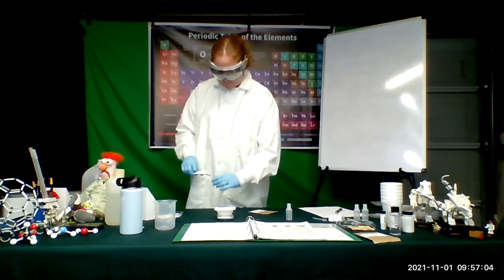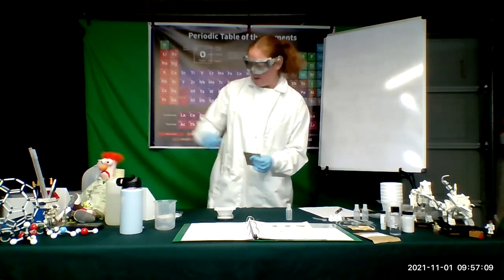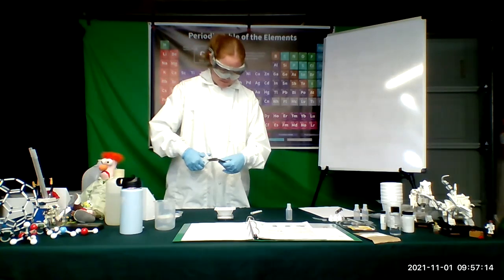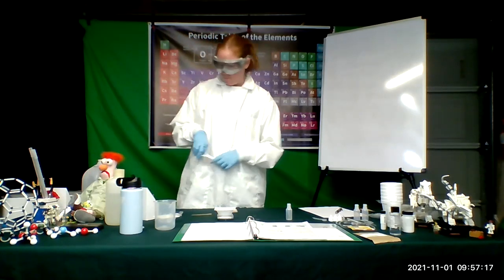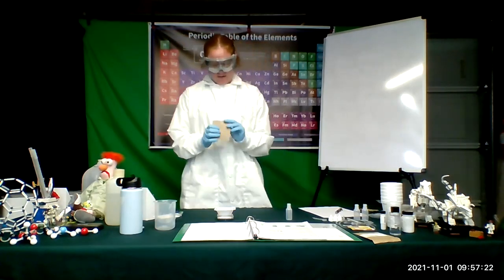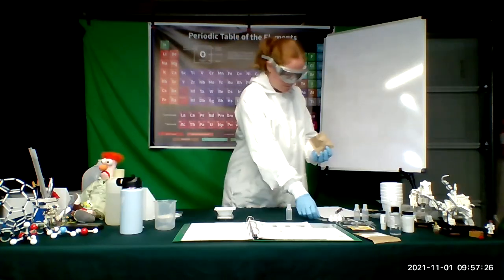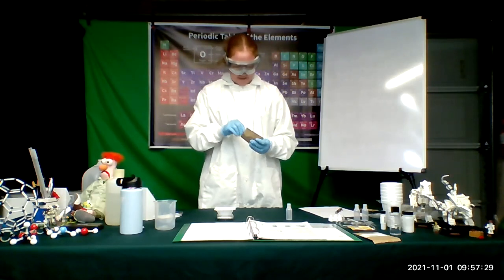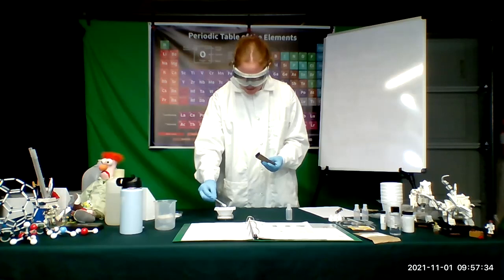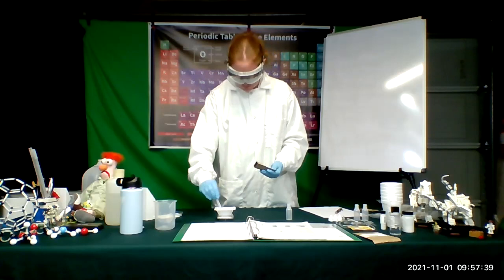I'm going to go ahead and cut open the entire top of it because I'm sticking a scoop down. It's sealed pretty high up so I'll cut down a little bit more. Normally I like to just cut open a corner of things, but because I need to use my scoop and it's a little bit big, I'm going to go ahead and cut open the whole packet. So I'm going to need to weigh out about a gram of my sucrose.